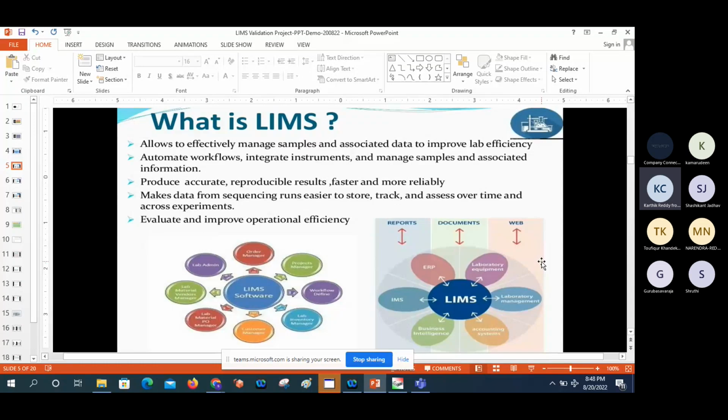So in documents, many documents can arise, and you can prepare them. As part of master data, this should be static data. It should not be changed occasionally. It would be changed when a change control is raised, or when we already have some data, like one analysis, and you want to modify it; for that, a QMS document is required. So documents can be involved in the LIMS operations, as well as reports.